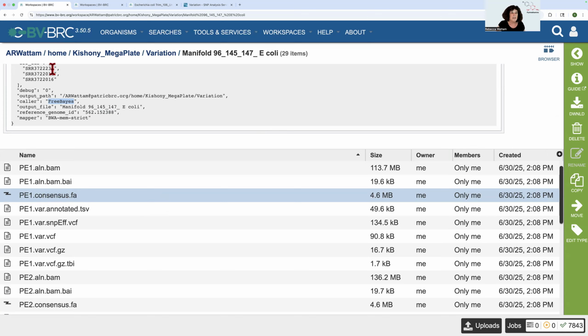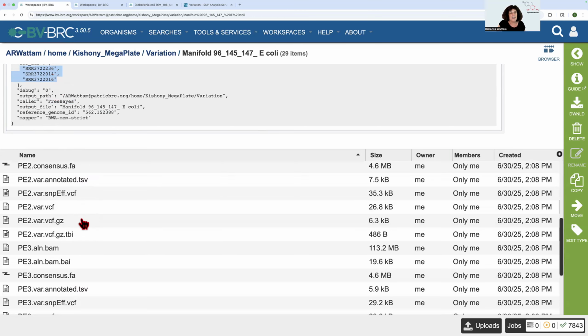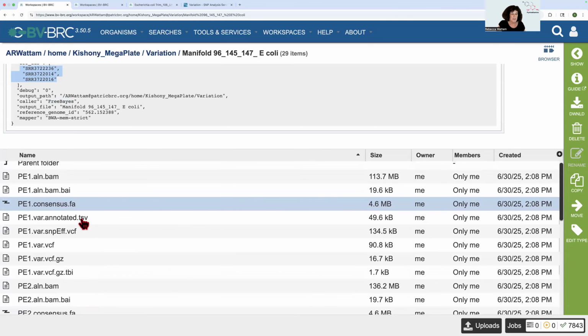When we submitted this, as you can see up here, there were 3. So PE1, PE2, and PE3. And you notice if I scroll down, each of these, PE1, PE2, and PE3, all have identical files associated with them. So I'm just going to show them for PE1.